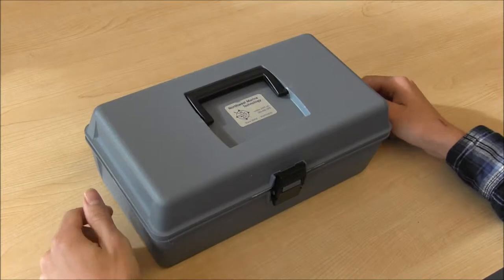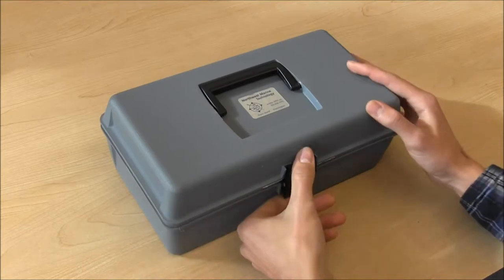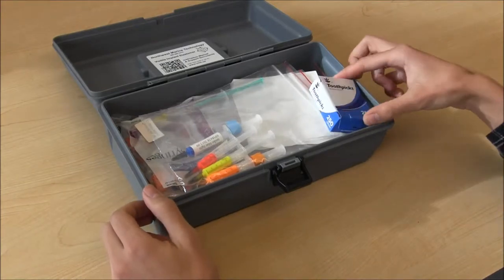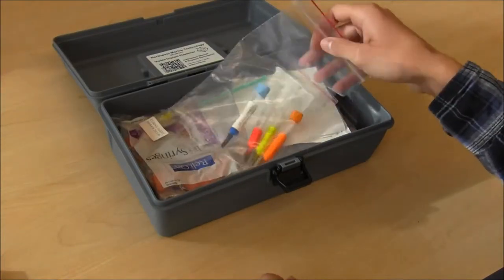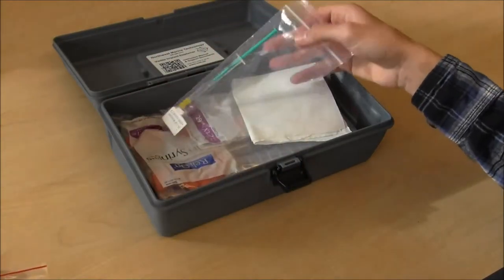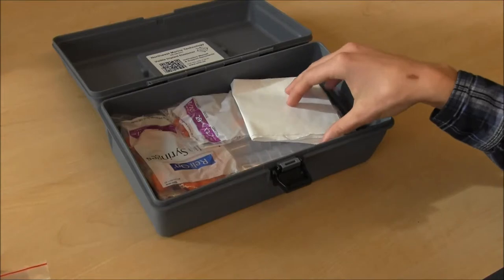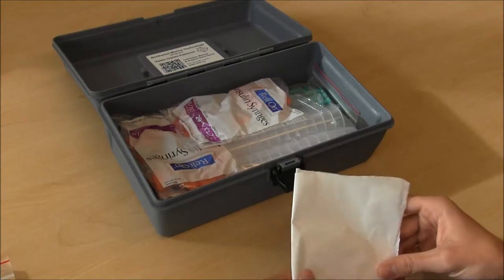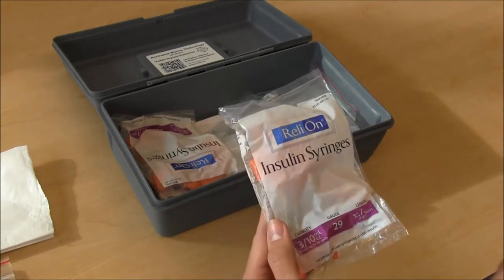To begin with, let's take a look at the materials we'll need. I'll be using this kit provided by Northwest Marine Technology, which comes in its own handy-dandy toolbox. Inside we'll need toothpicks to mix and load the elastomer into syringes, the different color dyes, the binding or curing agent, wax paper for mixing on, and finally a pack of 29-gauge insulin syringes.